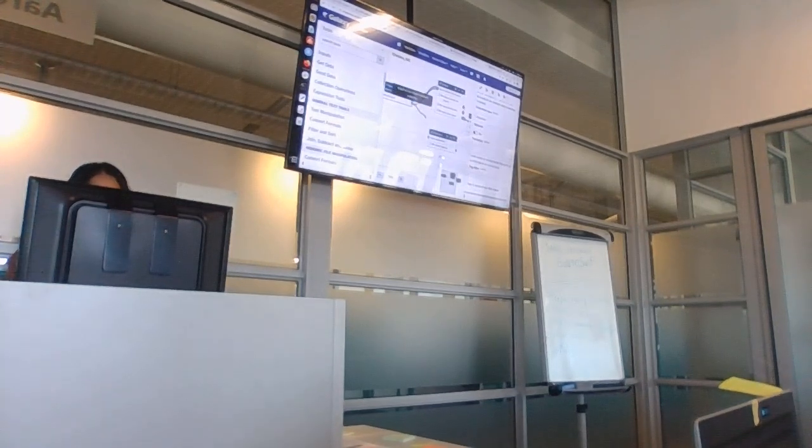After connecting it to here, you can click on Kraken, and you can actually do this with any of these tools. If you wanted to change any of the parameters in your workflow, you could do it. You could click on Kraken. Remember this Kraken we didn't set up, so you should change your confidence level, change the report like we did earlier, select the database. I'm just doing this fast, I know, but you've seen this before.